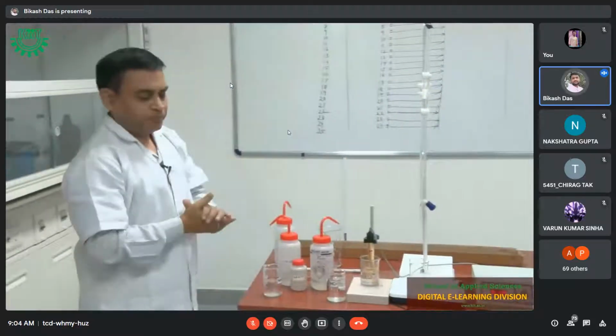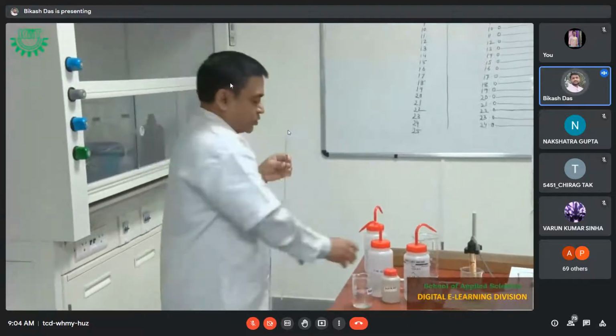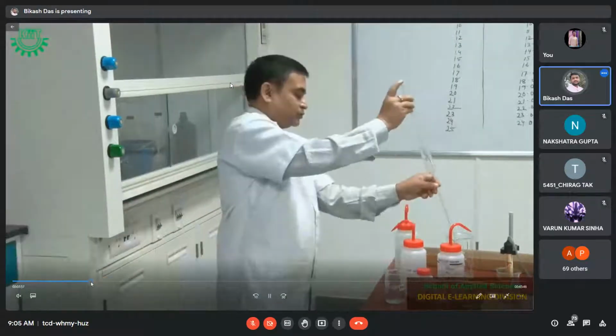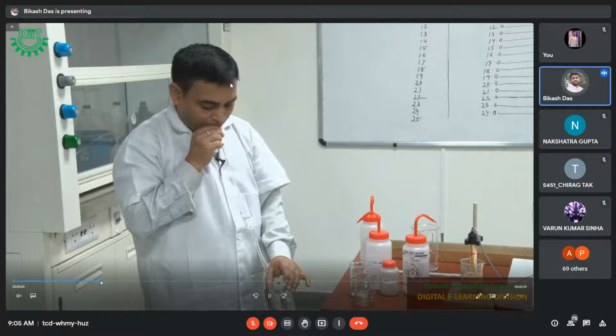Now we have to pipette out our analyte solution, which is HCl, using a pipette. And you see, this is the pipette of 50 ml. We need a little more solution for doing these experiments. Which solution do we have to pipette out? HCl, hydrochloric acid. Now you see, sir is pipetting hydrochloric acid using the 50 ml pipette.